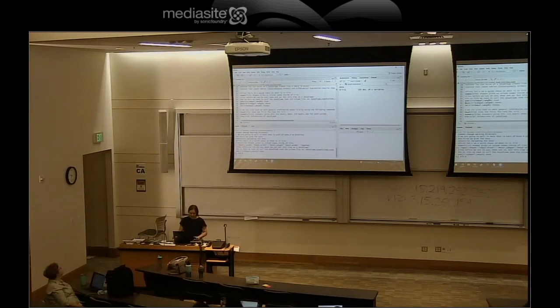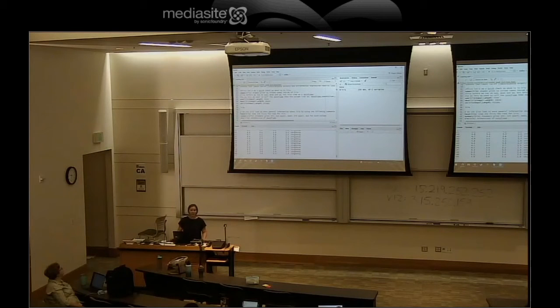And we're actually going to sum along that column, just like we did with that list, right? It makes sense because essentially one column of a data frame is a list. It just exists with other things around it. We can run it and get our mean and standard deviation like before. Now, this won't be in your script, but if I were to just type out iris and run that to see the whole data frame, it's going to give me this big old snarly thing. And like your gene lists, they're going to be really long. You're not really going to want to try to look at all of them at once.